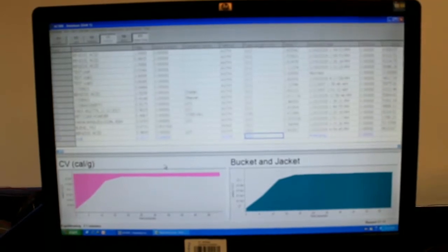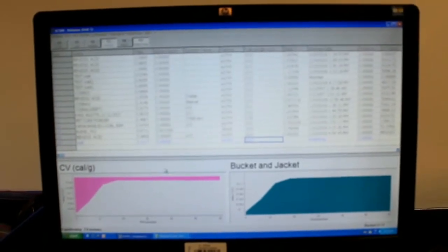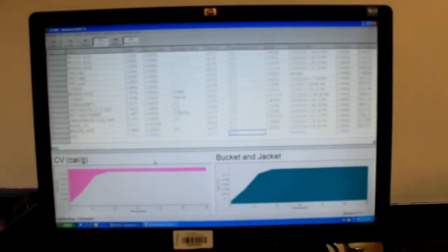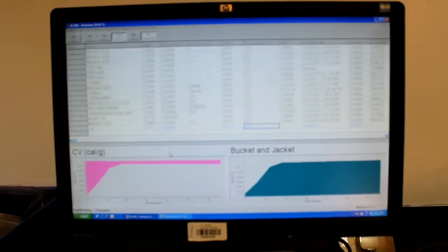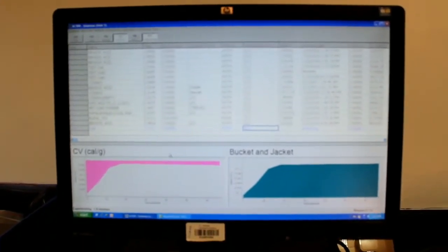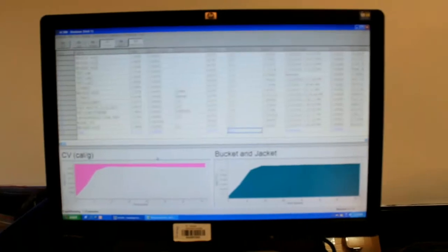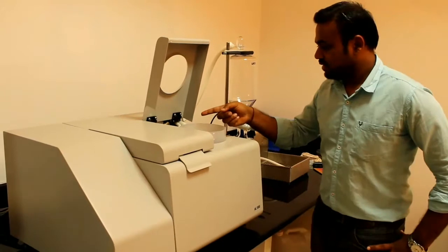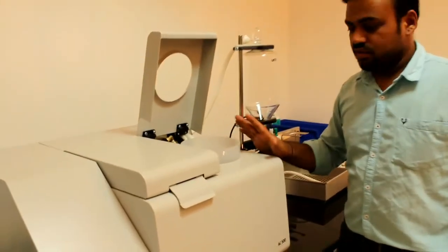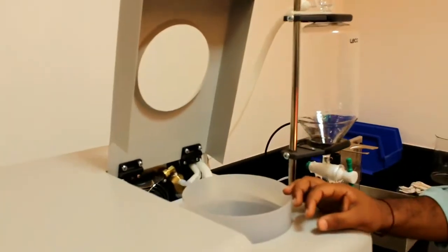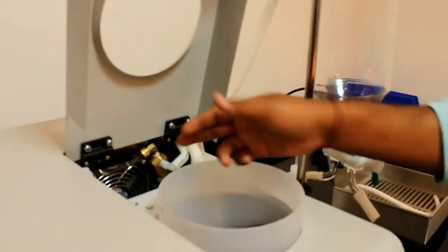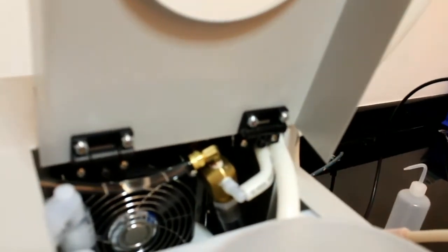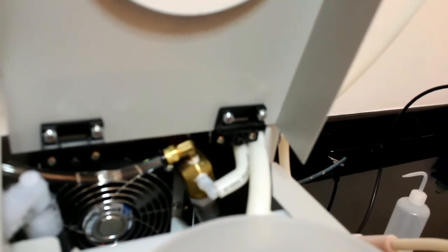See, now the temperature is matching. To match both the jacket and bucket temperature, we used heat exchanger. See, you can check here the heat exchanger. This is the heat exchanger of the instrument. Usually we call it as a chiller. Here we have heat exchanger. By using this heat exchanger, it matches both the temperature, jacket and bucket temperature.